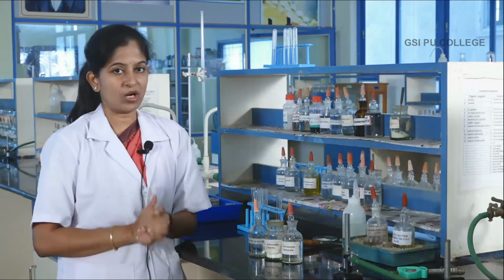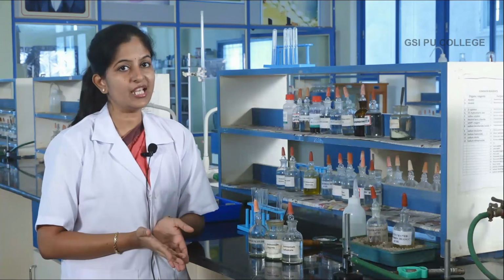You have to analyze in order, that is, you have to first analyze for barium, do the confirmatory test for barium. If it is absent, go for strontium. If it is absent, then finally go for your calcium. That is, haphazardly you cannot analyze first calcium followed by barium or followed by strontium.